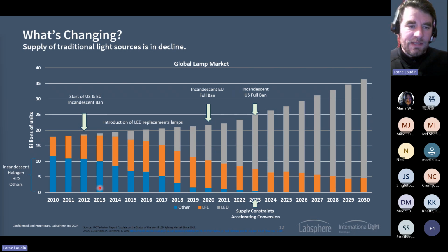So what's taking place in that process from a business perspective is that manufacturers of incandescent and halogen lamps are abandoning the manufacturing of incandescent and halogen lamps in favor of LED sources, which makes a lot of sense if you're building residential light. To that end, however, a lot of the companies that built residential lighting, building lighting and architectural lighting also manufactured the scientific lighting lamps that we were all familiar with and have had to look for replacements for in the last several years.